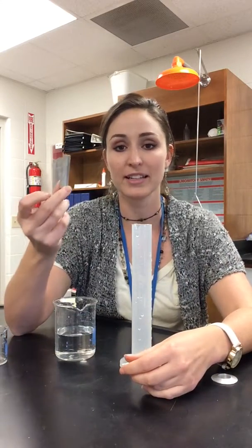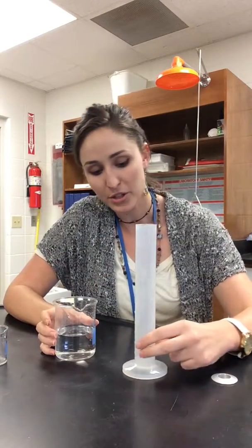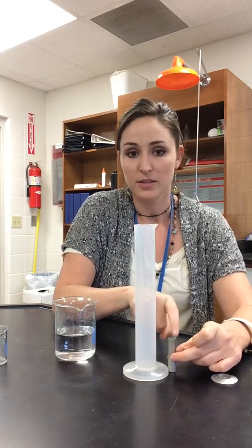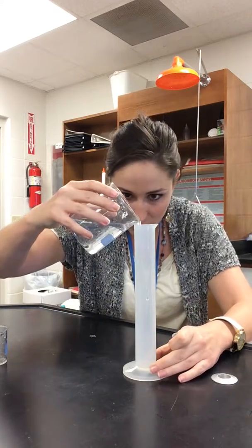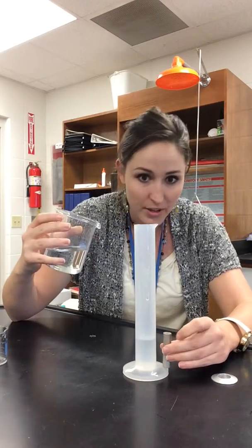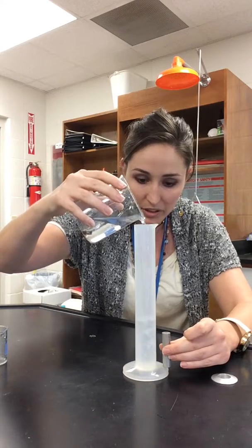So for something like this, you have to use what we call water displacement to measure the volume. So you're going to fill up your graduated cylinder. It doesn't really matter how much water you put in there as long as it's enough water to cover the object, so our cylinder that we're going to measure the volume of. So I'm going to pour, doesn't matter, enough to cover. That might not quite be enough. You want to make sure you've got plenty in there.